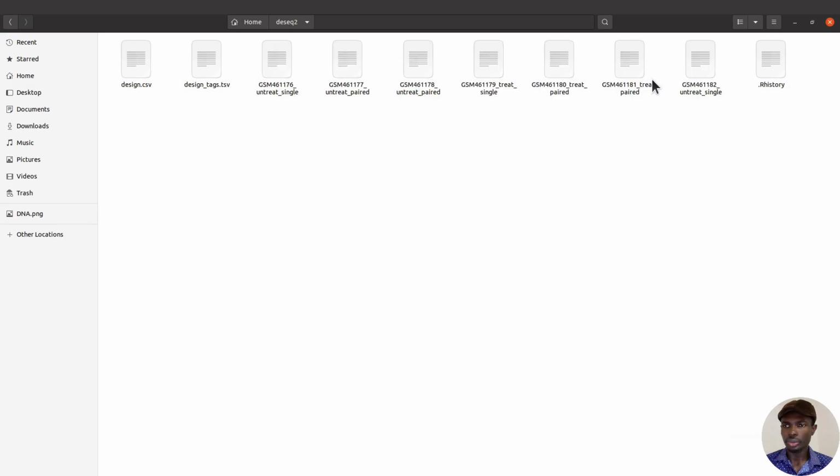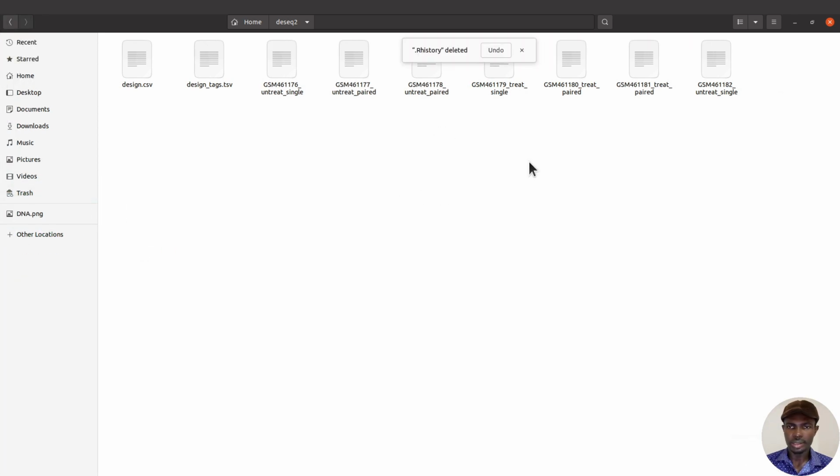Okay, so that's it. This one is not part of it. I think I don't need it. It's the file that I don't need. It's not part of the data itself, so don't worry about it.